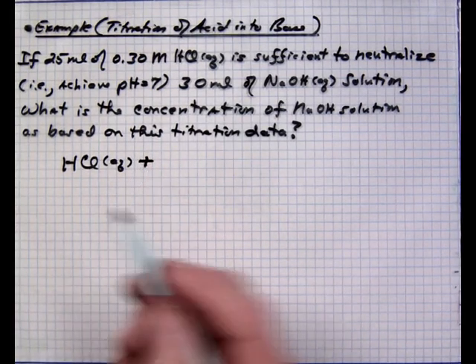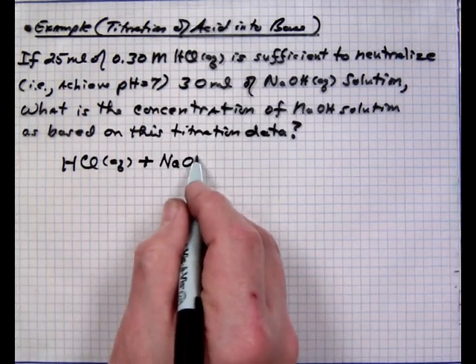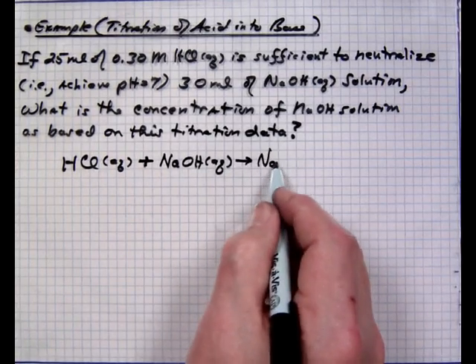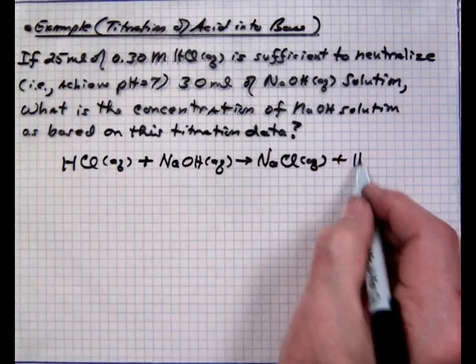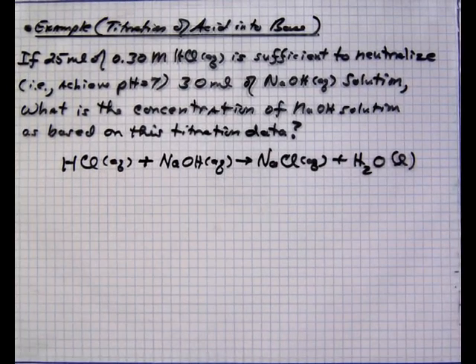But right now, for 1-to-1 reactions, hydrochloric acid and sodium hydroxide react 1-to-1 to produce sodium chloride plus water, as shown here. Now, a simple data sheet would suffice.